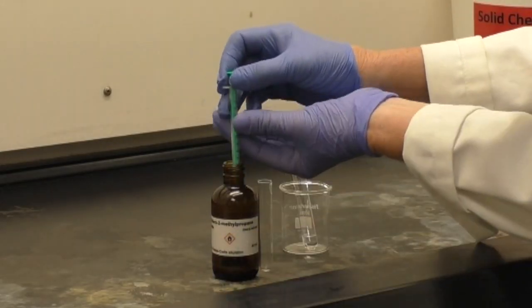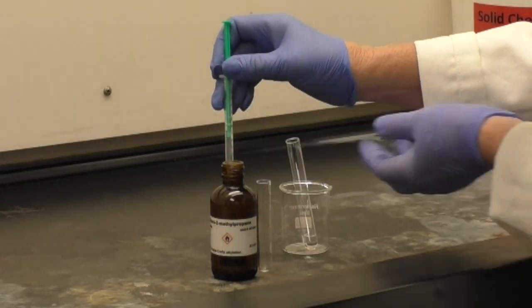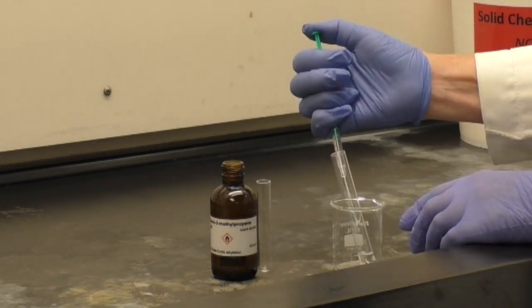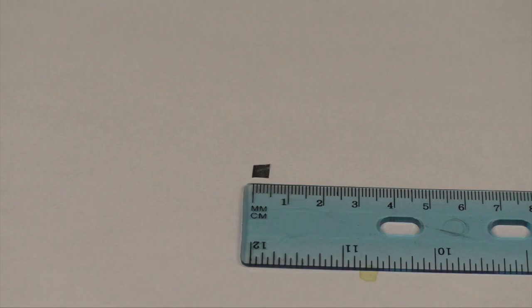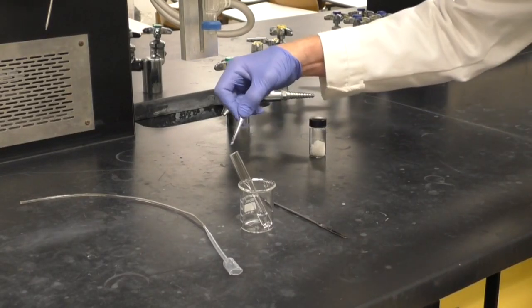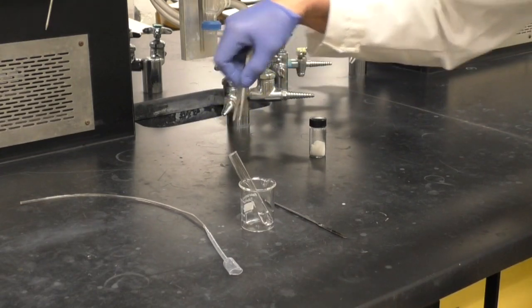Then add 0.35 milliliters of tert-butyl chloride and swirl to mix. Your instructor will have cut aluminum foil into 3 by 3 millimeter squares. Add one of these to the test tube.